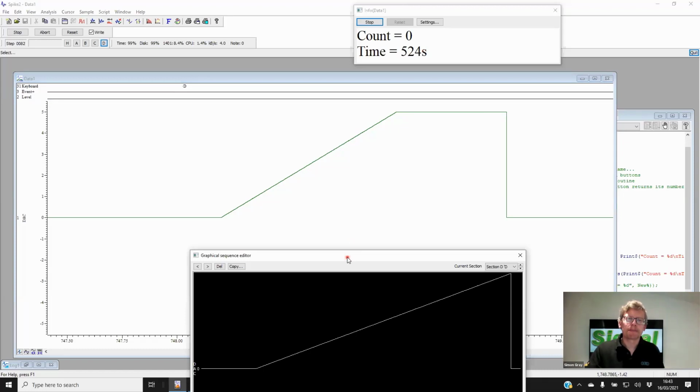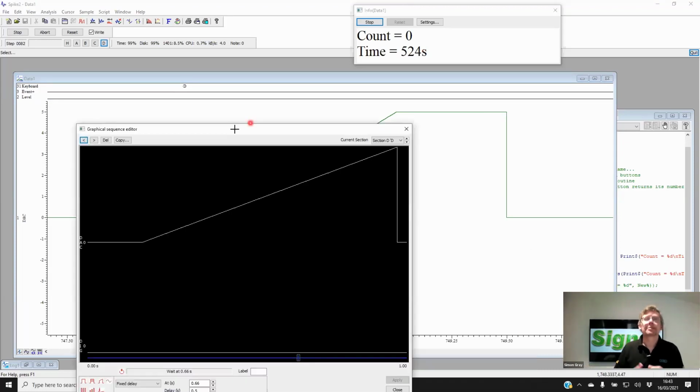Well, there are some outputs, just like the ramp, that we can say, this is your target, go to it, and it'll just be left alone. We're not interrupting it. A long time ago, we had to calculate each step and work through that way. These days, it's, as I say, a slope, a target has been calculated, and it's fire and forget. So we're not interrupting the output here.